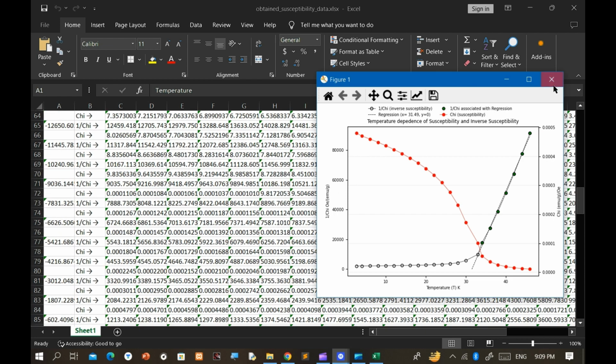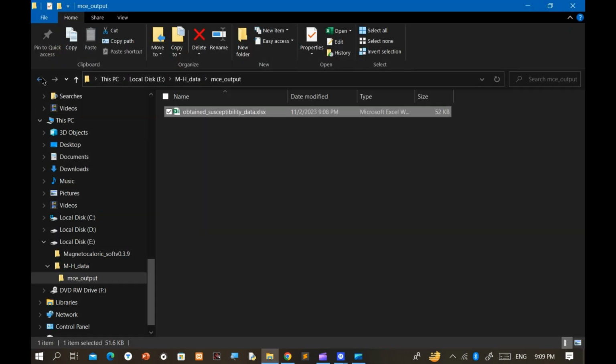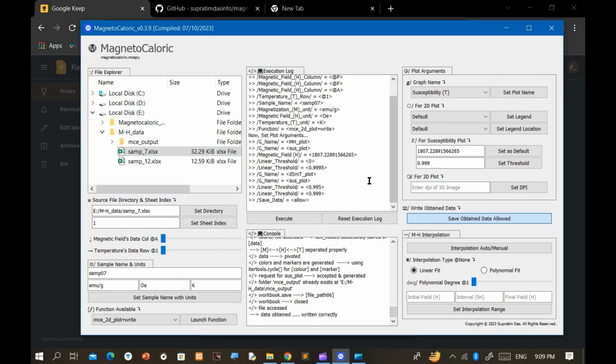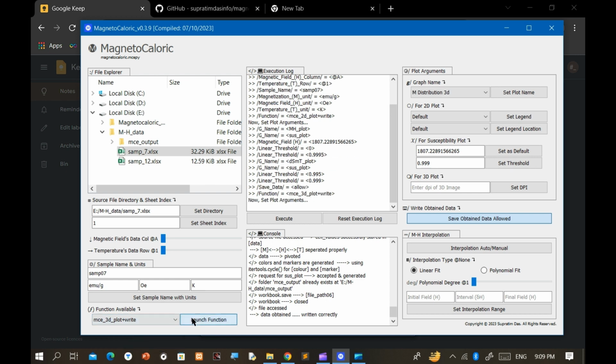To create a plot for the switching field distribution, SFD, an important parameter in magnetic media, representing the dispersion of fields needed to reverse the magnetization direction of individual grains, simply follow these steps.